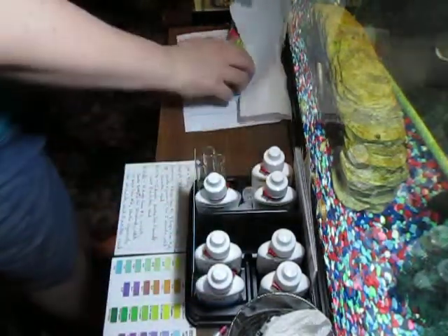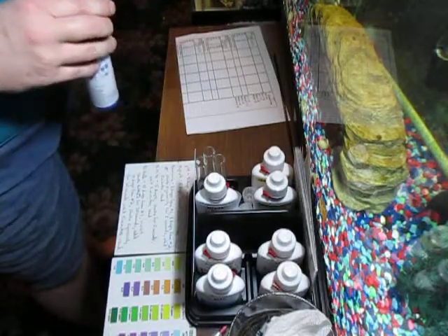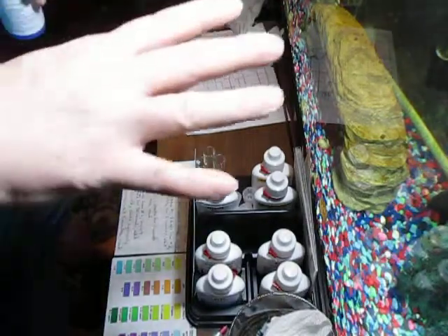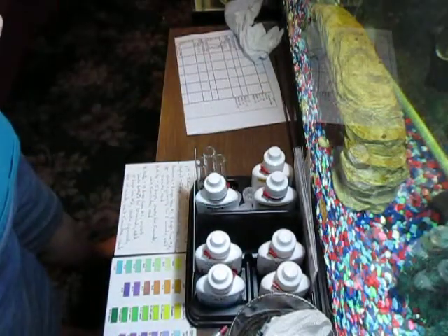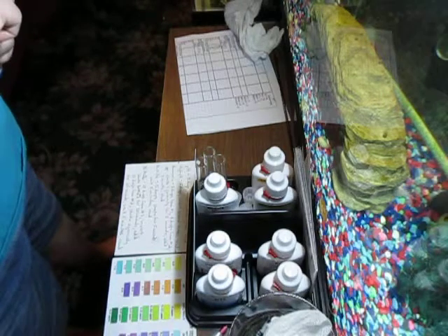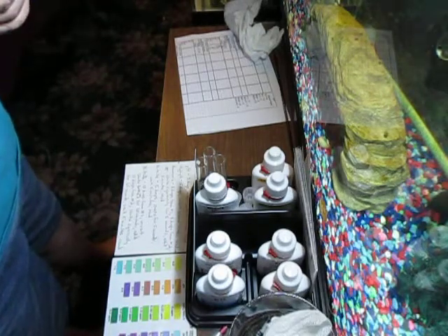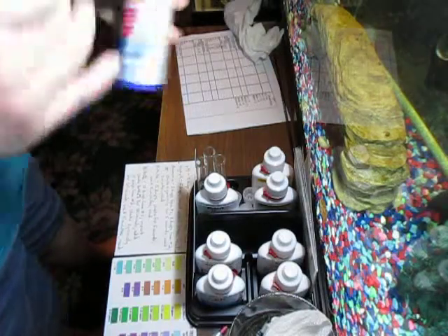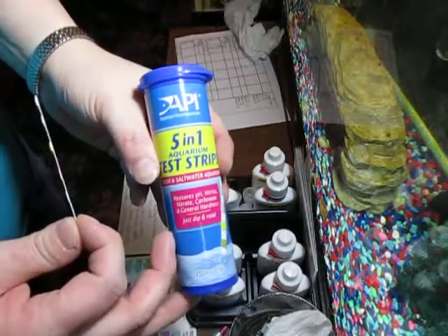Today I'm doing chemistries. Yesterday I went ahead and added water to the tanks to fill up the evaporation, so I'm doing chemistry today. Basically the test strips are API five in one.